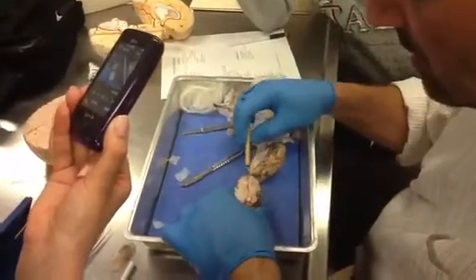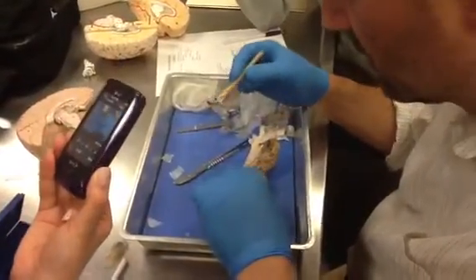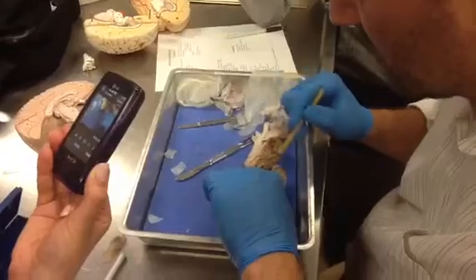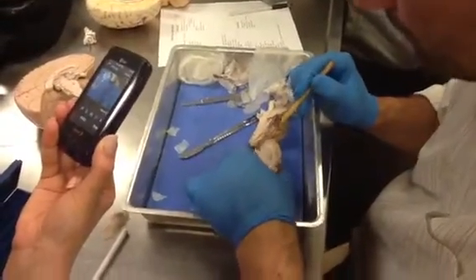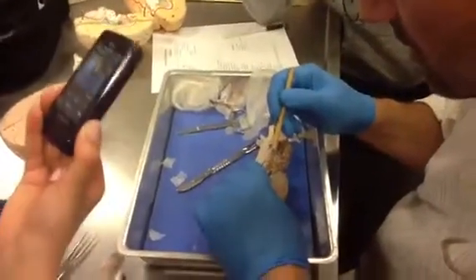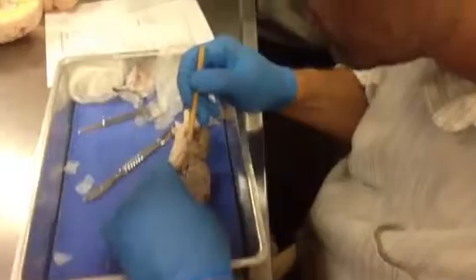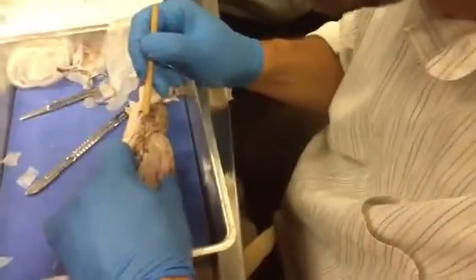And as we move below the thalamus to the bottom part of the brain right here, the floor, you'll see, first of all, this is that optic nerve, remember? So there's the optic chiasm. That's right where it crosses, right in there. And then this little area just behind it is where the stalk would be for the pituitary gland, would attach right in here.